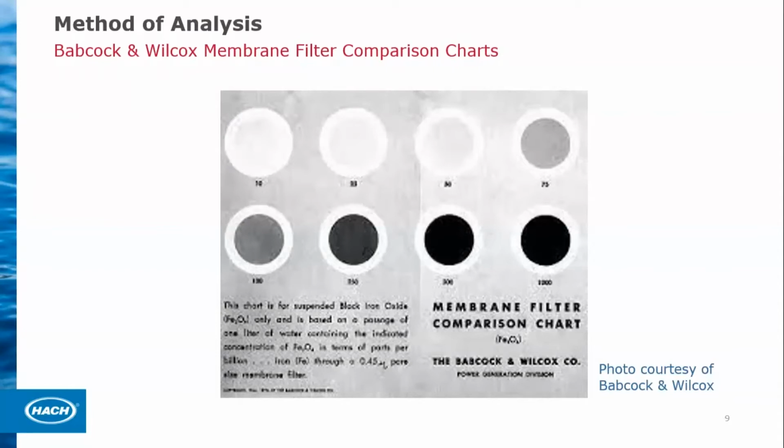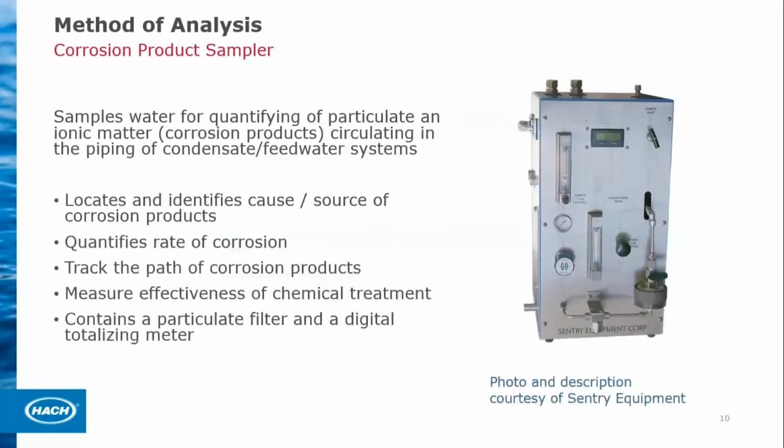So whatever it is that you're doing at your facility right now, if you do it properly, it's going to give you some valuable results. And you know, the filter tests here are going to tell you if you've got iron. They're not extremely quantitative, but they're going to give you a pretty good visual and a pretty good idea of where you are on the spectrum.